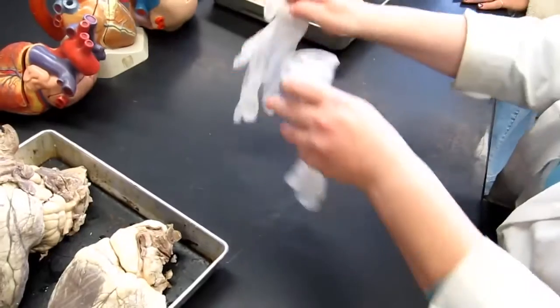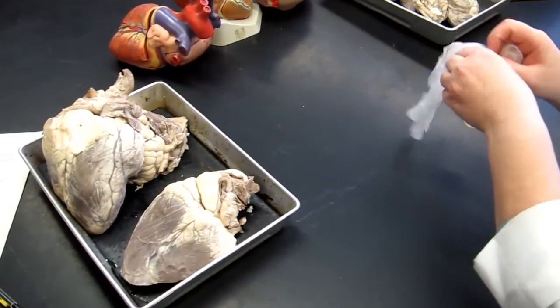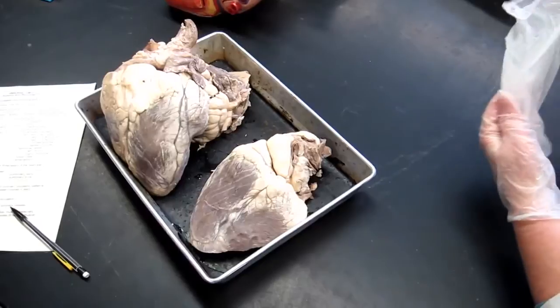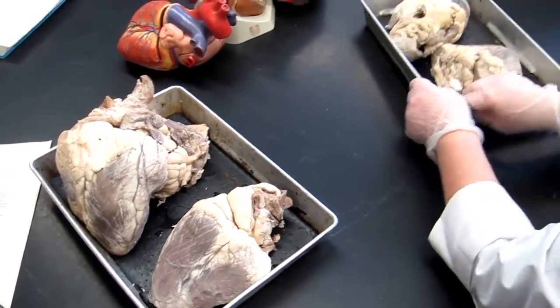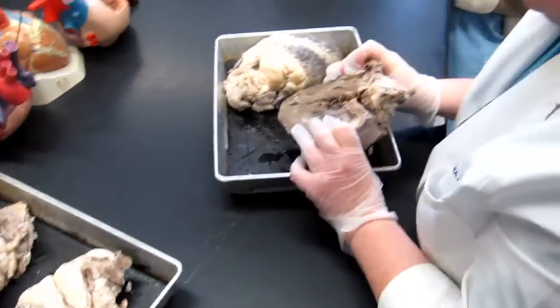And if those are in your way here, just scoop them to the side as I'm starting to show the calf hearts. I know we didn't do the papillary muscles or the chordae tendineae, but I probably will ask you those on these hearts anyway, because they're much nicer. And that'll be asked on the living. Yeah, the formerly living heart.